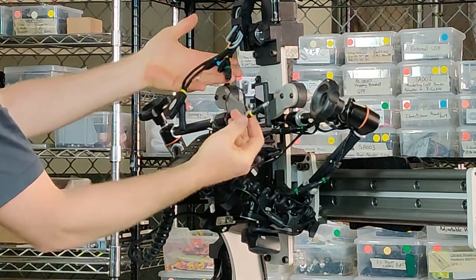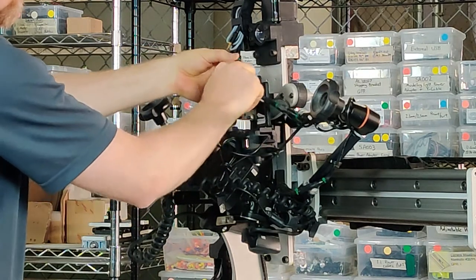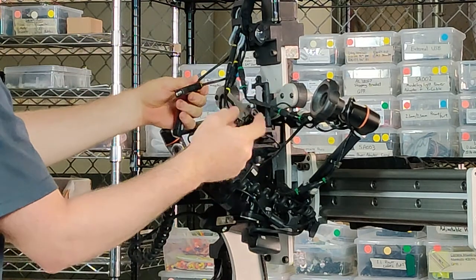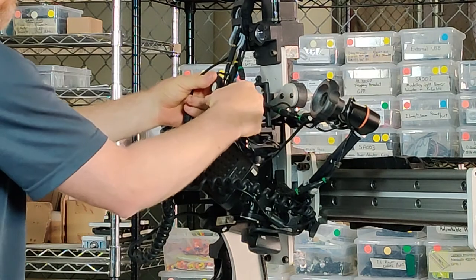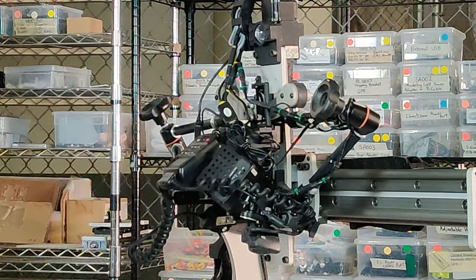Then plug in the cables and the USB. And there we are.